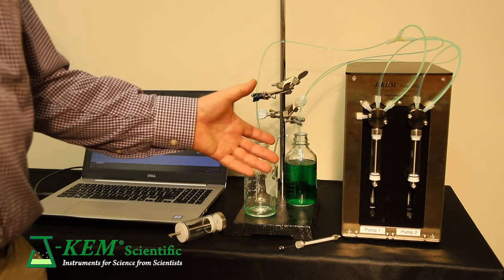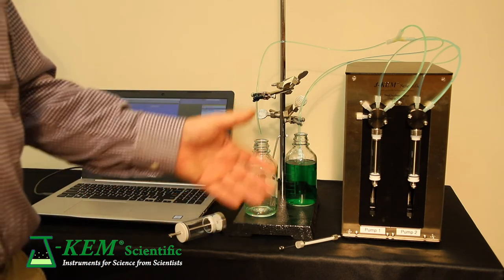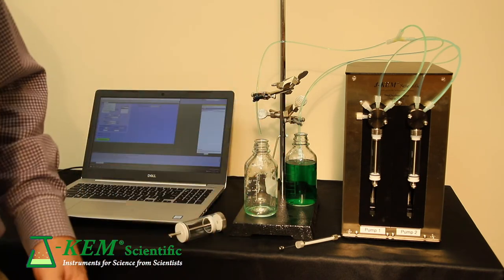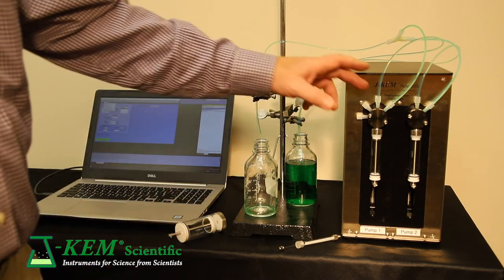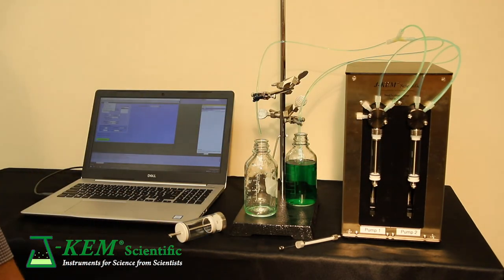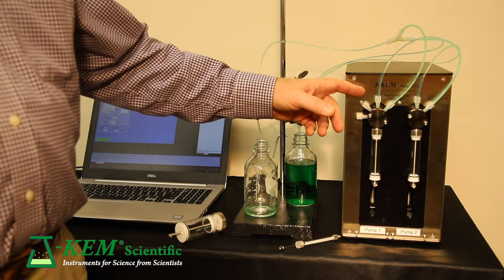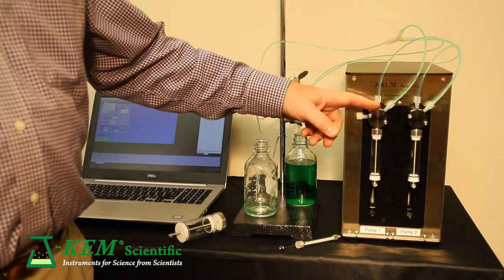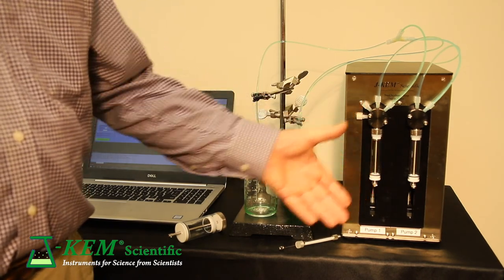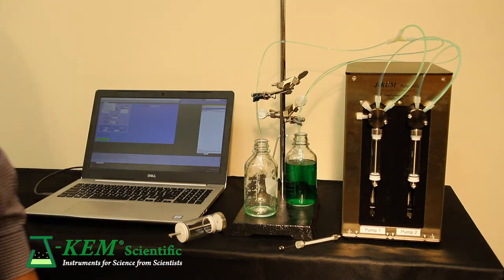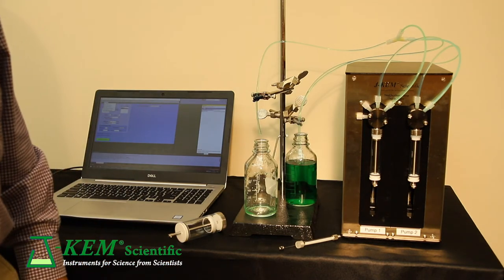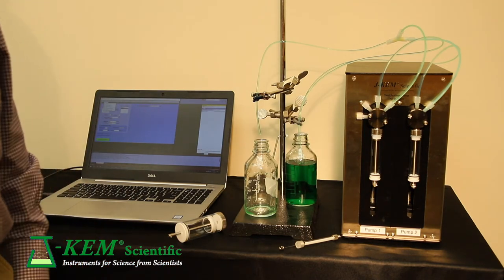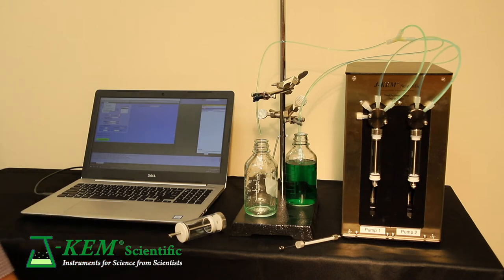You can get the pump in many different configurations. What's in front of you now is a dual position pump because it has two independent syringe pumps on it. You can buy a single position pump which would have only one module on it. This is a dual position pump, but it's routine that we sell 4, 8, 16, or even a 32 position system. So you can customize it to anything that your application needs.